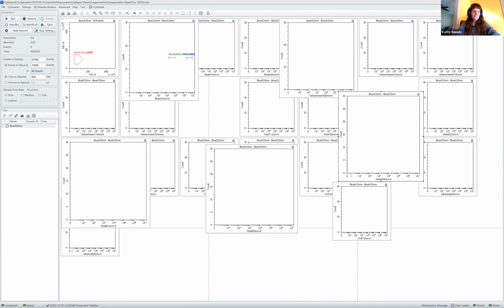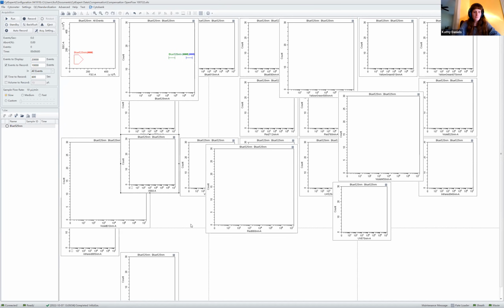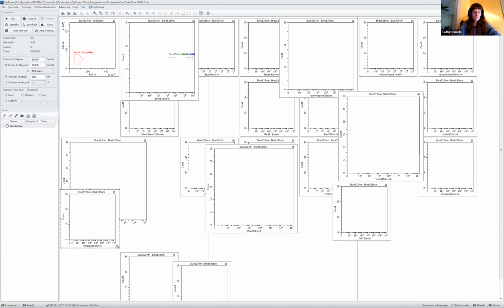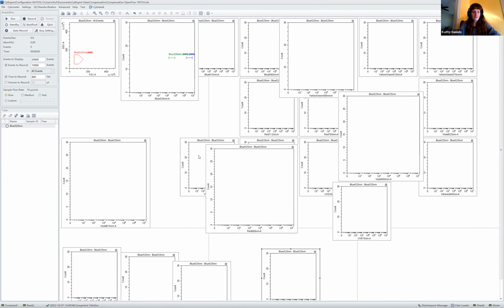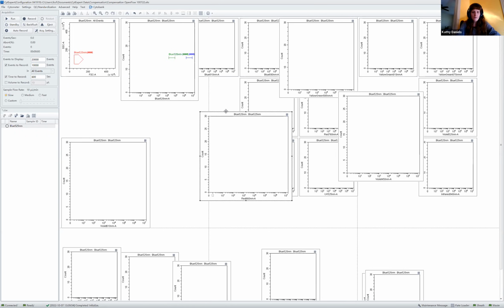All right. So with that, I know the screen's a little bit messy. I probably should have taken that time to clean it up a little bit, but maybe that would make it a little bit easier for everybody. So I'm going to go ahead, because we have the time today, and just clean it up a little bit. This isn't going to apply a little bit later on, but just to try and clean up the screen, I'll try and move some of these. Okay. And I'll just cover some of the other ones.